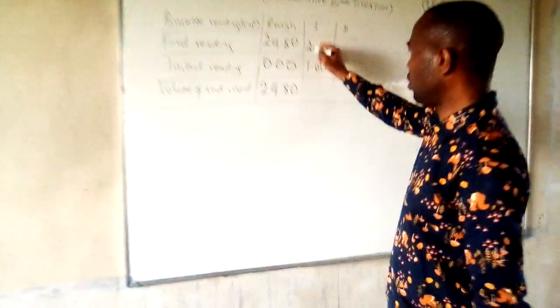At 25, we'll stop, then shake the flask, bring it back, and go drop by drop. All right, we have the color orange. See the color? That's our comparable. This is pure orange. So we now have 25.50, 25.50 is what we have there.